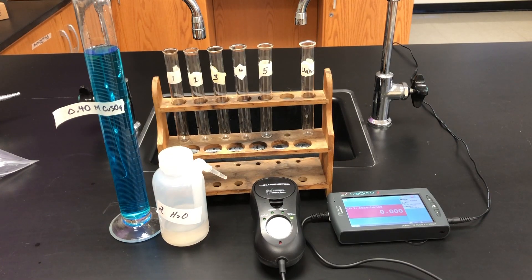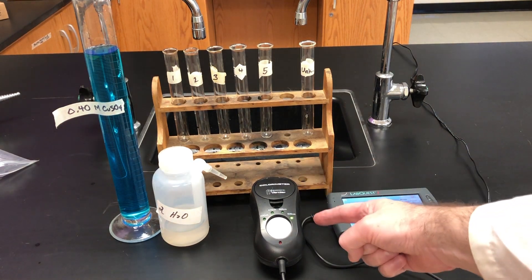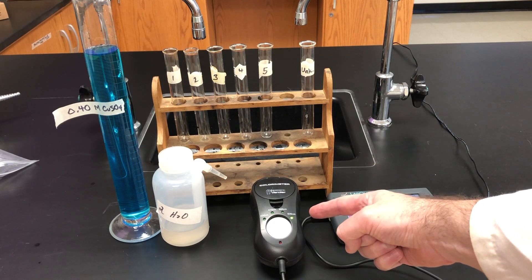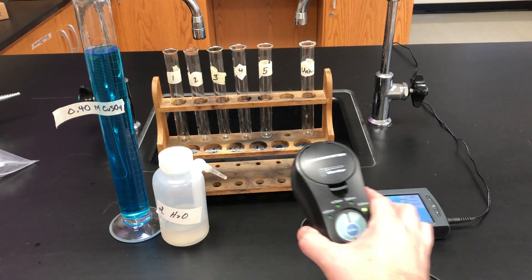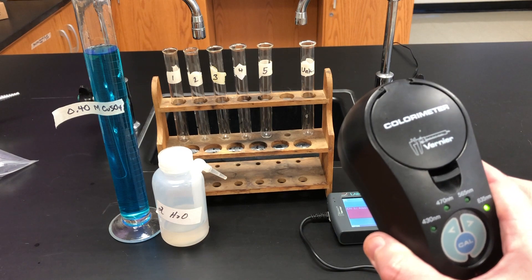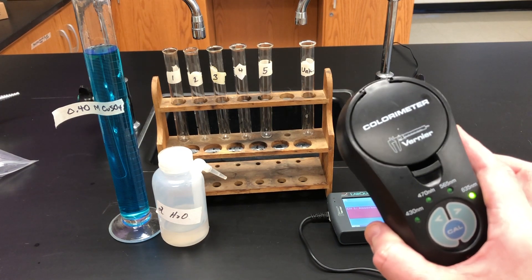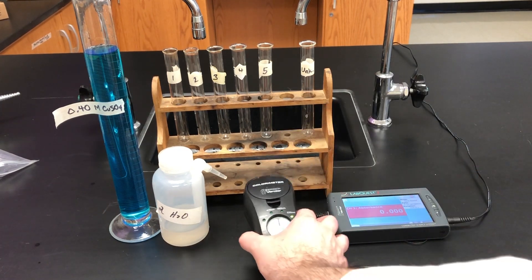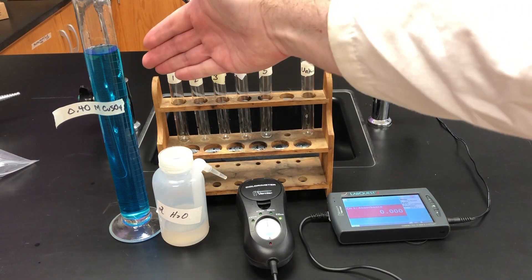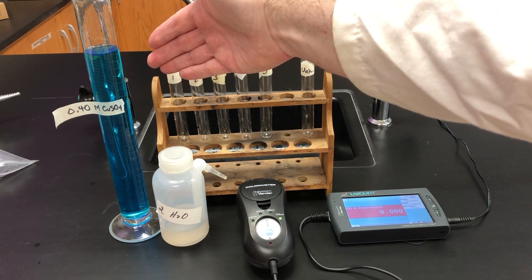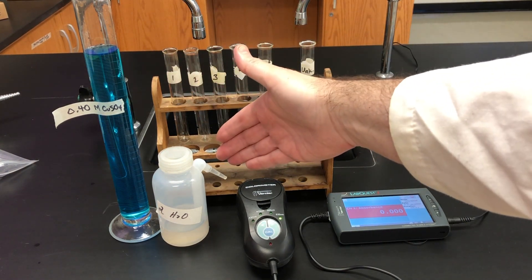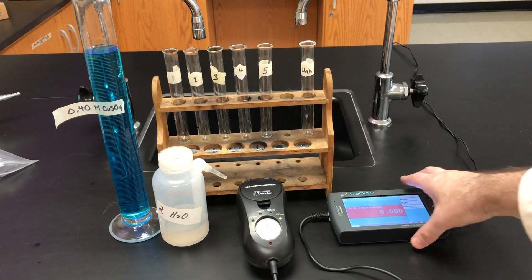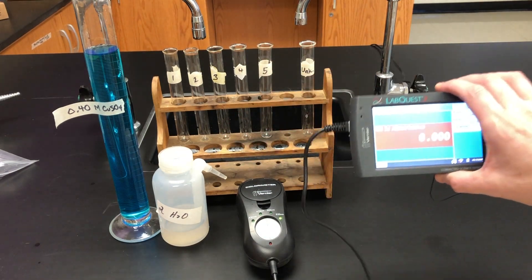What you see in front of you is a typical setup to complete a Beer's-Lambert's Law lab. There's a colorimeter right there, and as you can see, it's not that big. Inside of it is a square cuvette, and you can see it's set for 635 nanometers, which is red light. There's our copper sulfate solution, you can see it's blue. We have some distilled water to dilute the solutions, and that's our lab quest.